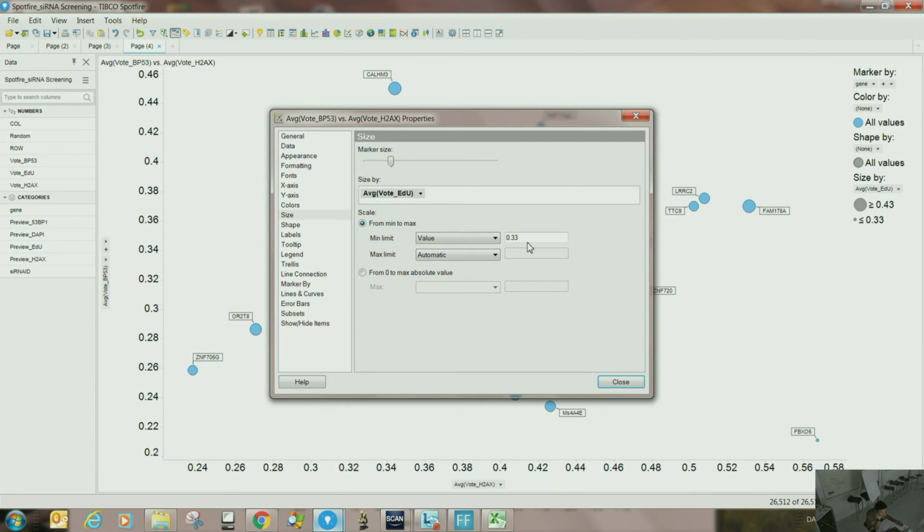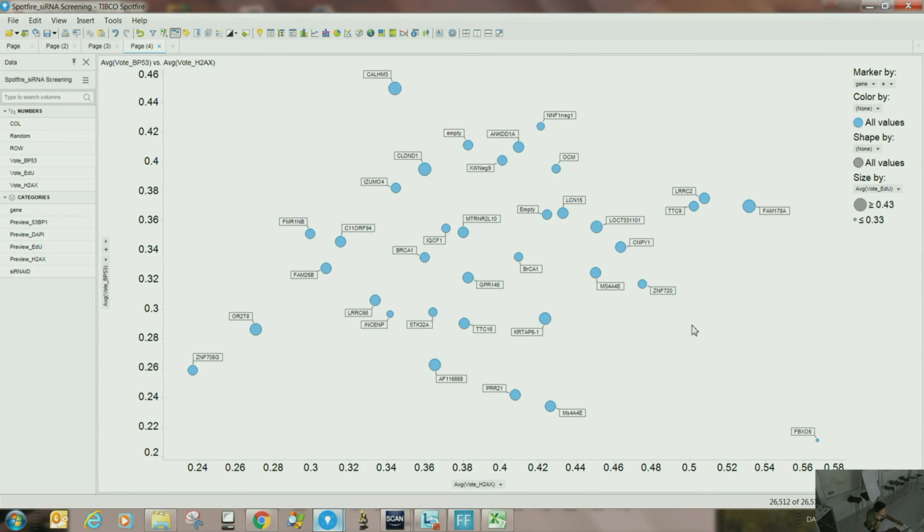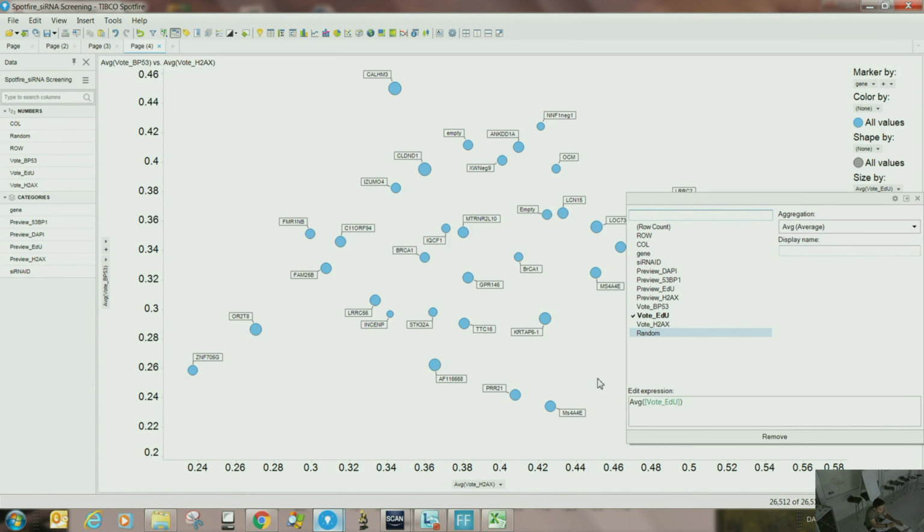But do you know what it's calculating based on? Is it an average, or does it just randomly assign numbers? No. Basically, it goes from minimum to maximum, and then divides into, let's say, quartiles, intervals. I don't know exactly what criteria they use. But you can set it manually. Oh yeah, exactly, that's possible.